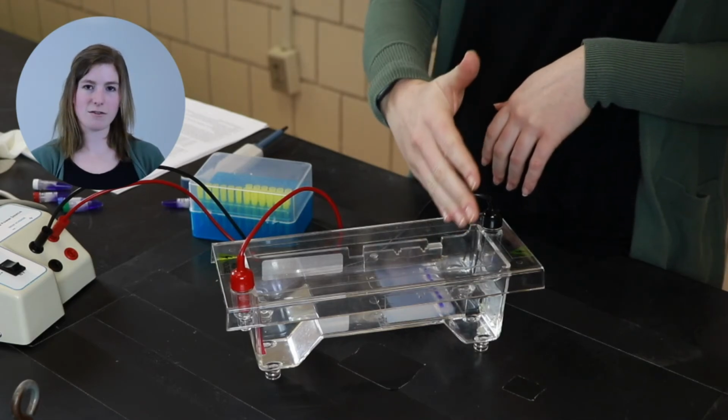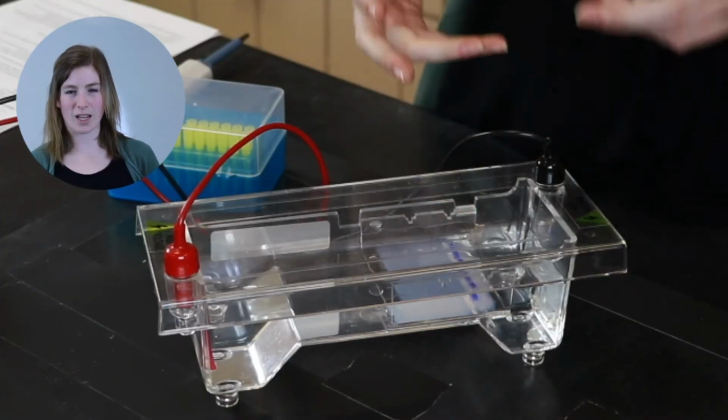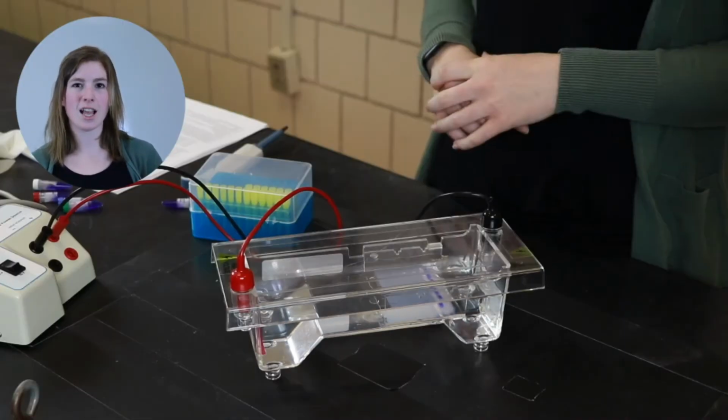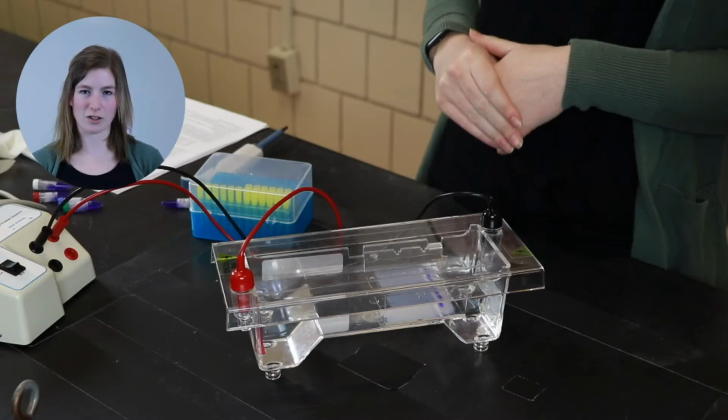So I'll let this run for about 35 or 40 minutes. I'll take it out, dry it off a little bit, put it on the UV light box, and we'll get to see our results of our gel.